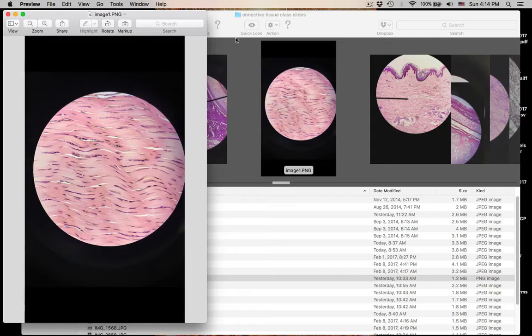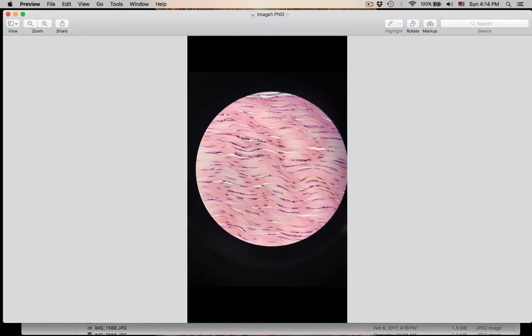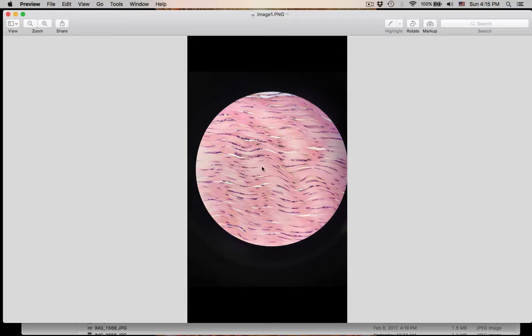This is a beautiful slide — dense regular connective tissue. Number twelve: dense regular. The collagen fibers are parallel to each other. These cells with the flattened nuclei that make the collagen — these are fibroblasts. The nuclei are flattened because the collagen is filling up the matrix and squishing down the cells. Dense regular, and these are the nuclei of fibroblasts.